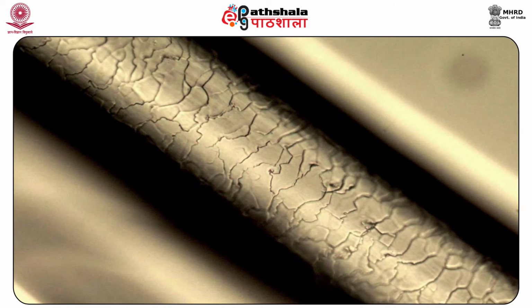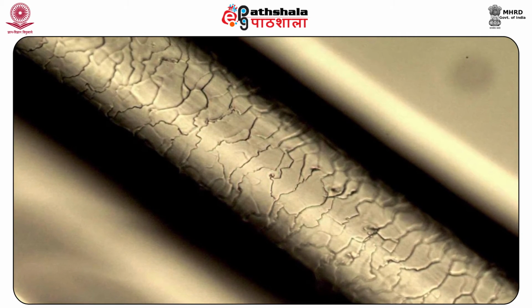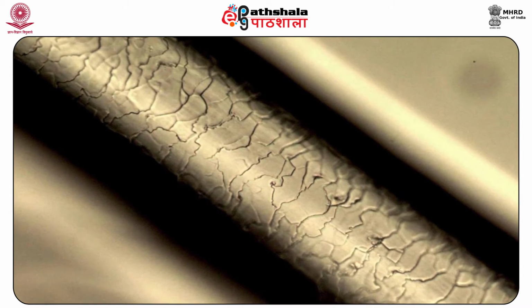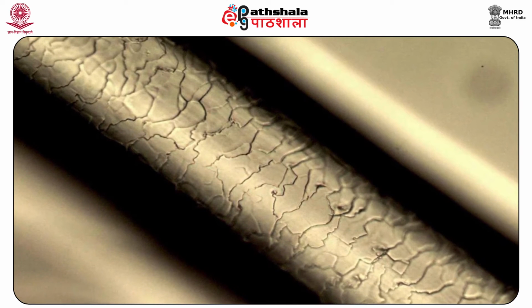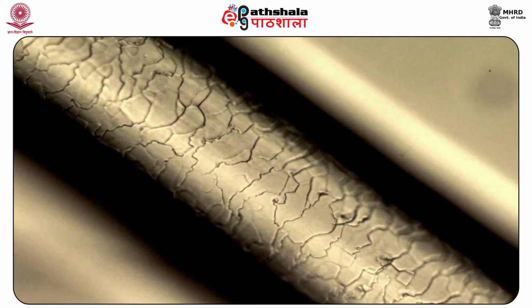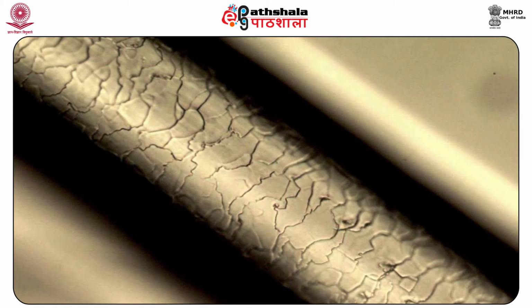The ratio of the diameters of the medulla and the hair, measured at the thickest point, is known as the medullary index. Its determination establishes the species of origin. The medullary index of human hair is commonly less than 0.3, and in animals it is generally more than 0.5.